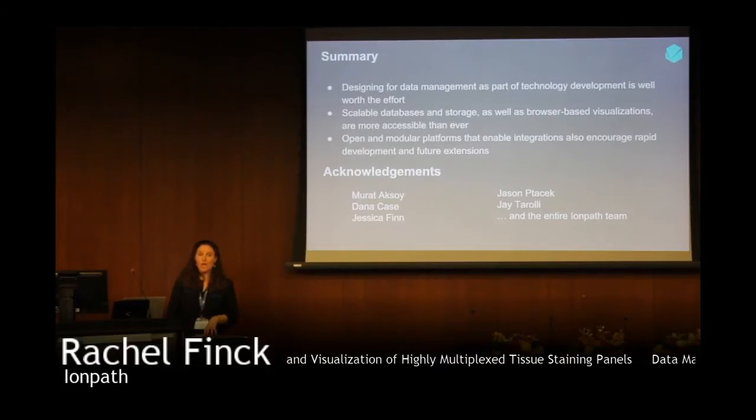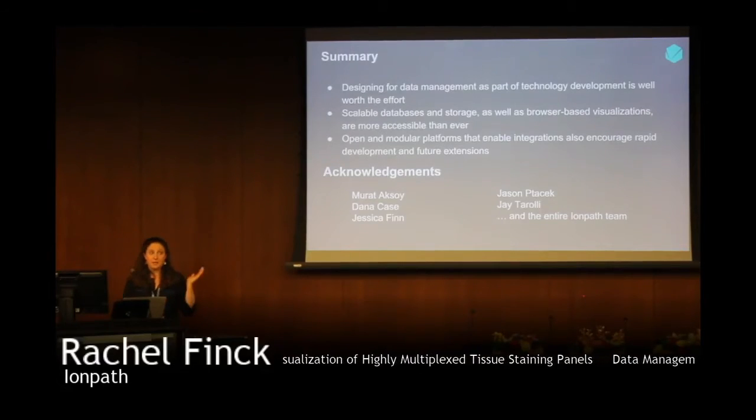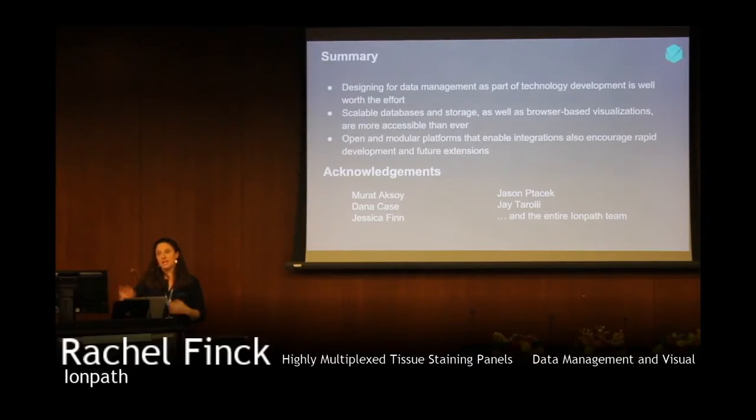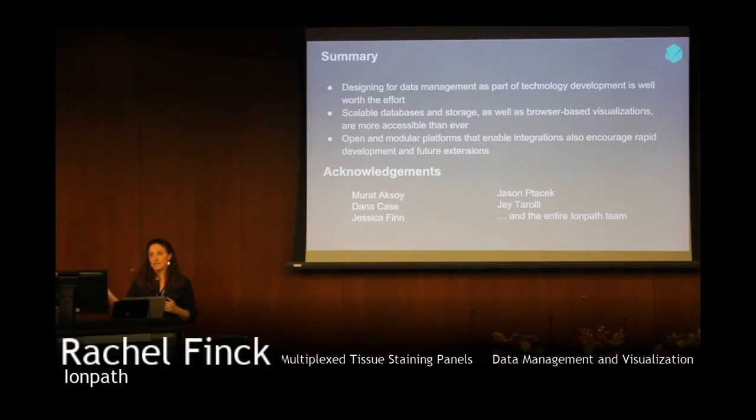So right now, this piece of software is available for adding data to it for all MIBI users, and we have a public instance of it for other members of the public, such as yourself, to look at and download the data that's available. And so if you're a MIBI user, you should have access, and if you're interested in using it someday with other data types, I'd be happy to chat about that.